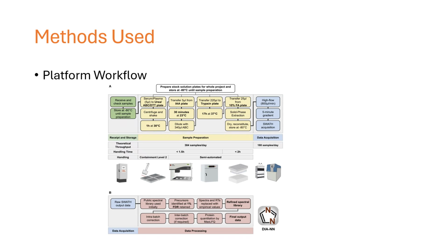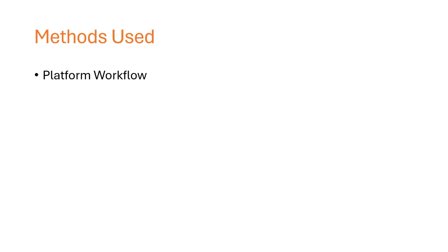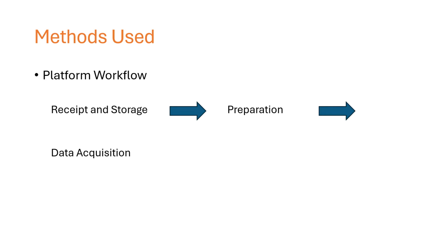So moving on to the methods used. We'll start with the platform itself. The authors actually included a workflow so you could see the process of their platform and what all is involved. In essence, there are 4 parts to the workflow, starting with receipt and storage, going on to preparation, data acquisition, and finally data processing.